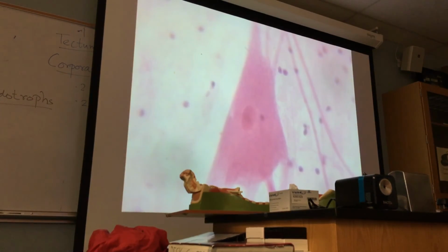So we have learned all the aspects from this slide. Okay? And the structures that are very important will be the axon hillock, initial segment of axon, the dendrite, and the cell body. Okay? Let us look at another slide. So this is slide number 1.